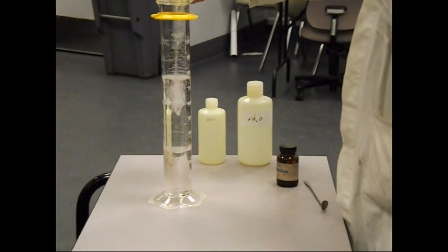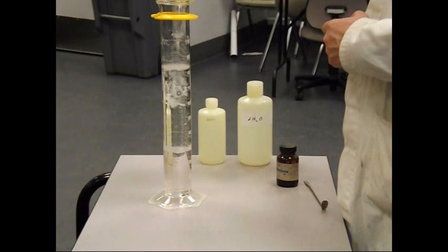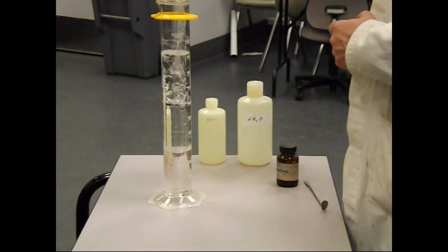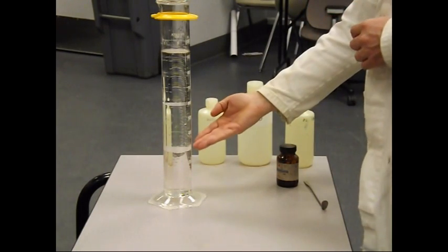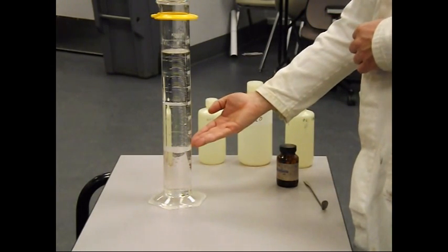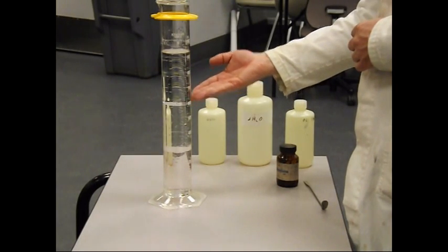Now hexane, which is totally non-polar, is also not miscible in water. So you have a layer here between the dichloromethane and the water and a layer up here between the water and hexane.